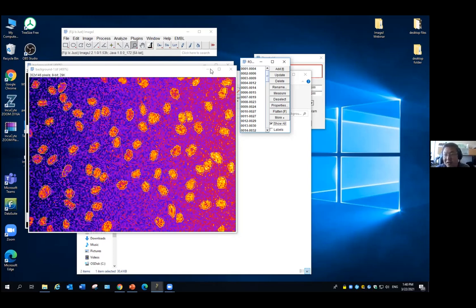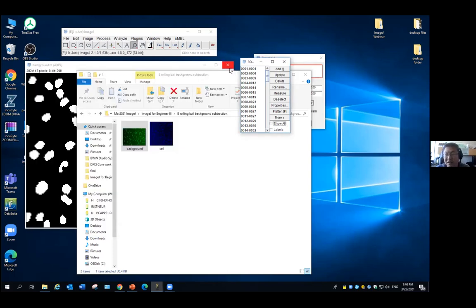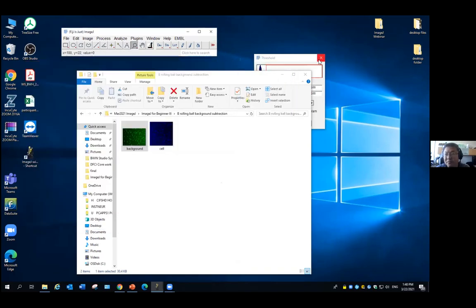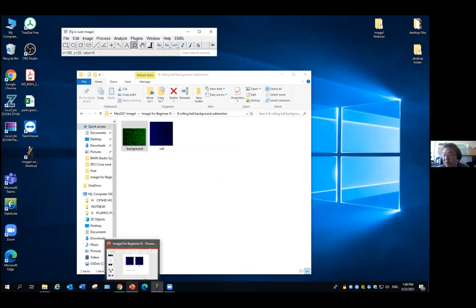And I'll ask, any questions on this, the uneven illumination part? You can unmute yourself at any time if you want to ask any question.